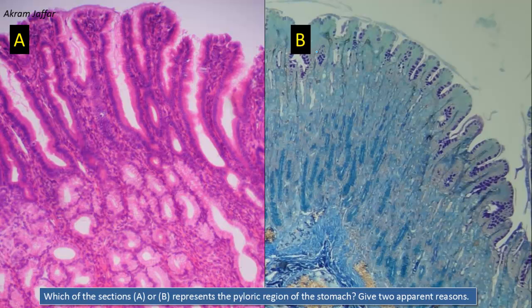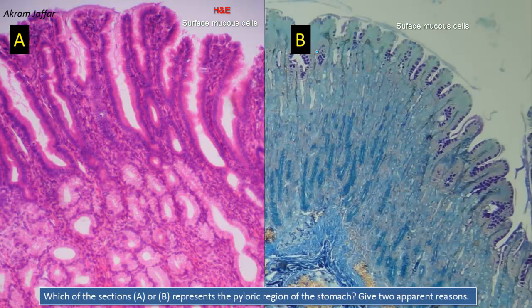Which of the sections A or B represents the pyloric region of the stomach? Give two apparent reasons. Both sections show the characteristic features of the stomach. There are surface mucus cells. The ones in section A appear to have an empty cytoplasm because they are stained with hematoxylin and eosin, which doesn't stain the mucus. Cells in B are shown to have a dark magenta color because the stain contains periodic acid-Schiff, which specifically stains complex carbohydrates including the mucins.